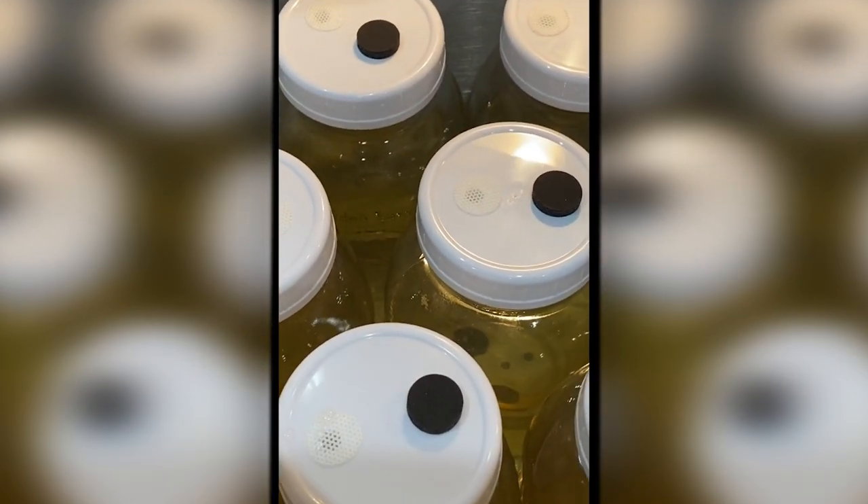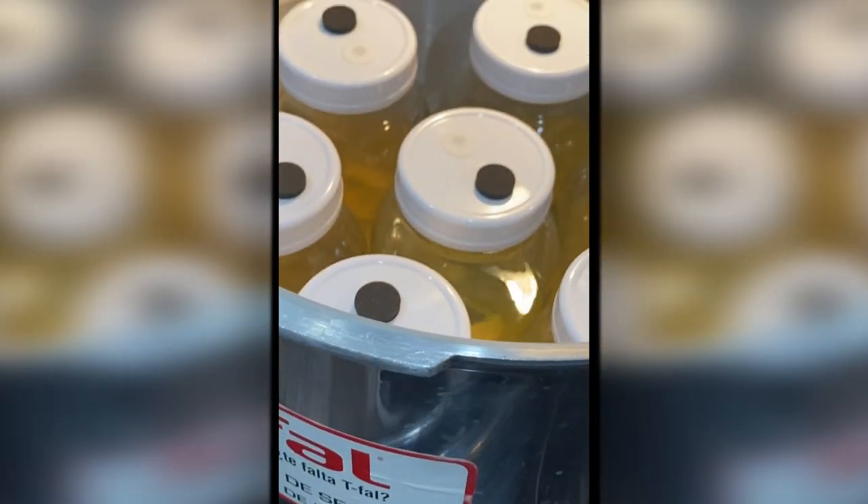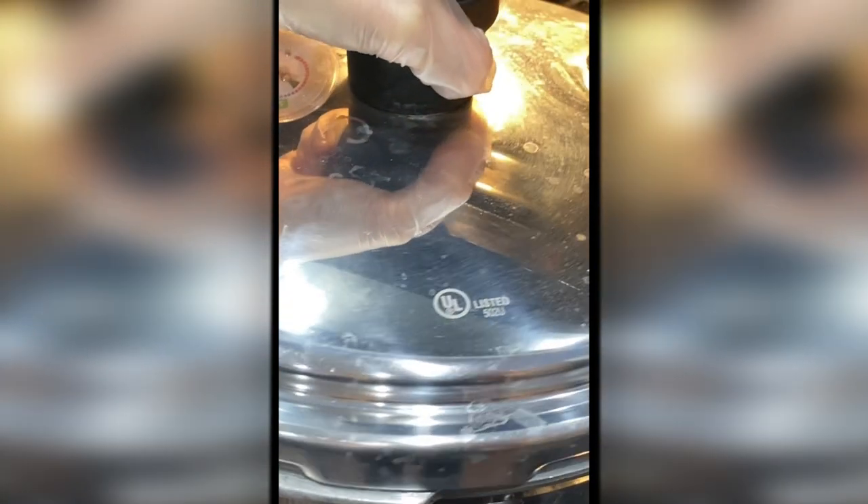Next, we're going to sterilize our media at 15 psi for 15 to 20 minutes. Some debate exists within the community about how long this should be, however we find that for liquids, 20 minutes is sufficient.